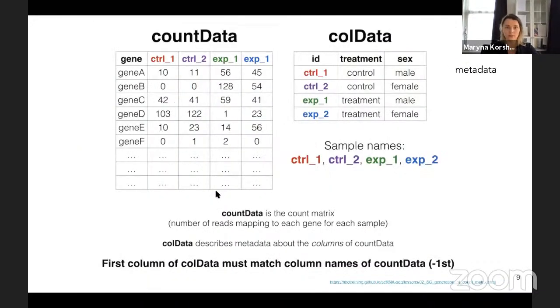So what is the count data, this count matrix? Basically, as you can see, there is a matrix. Of course, the representation of this matrix depends on the pipeline which you use, but in general, on the first axis you have the gene list, usually rows, and on the other the list of cells.